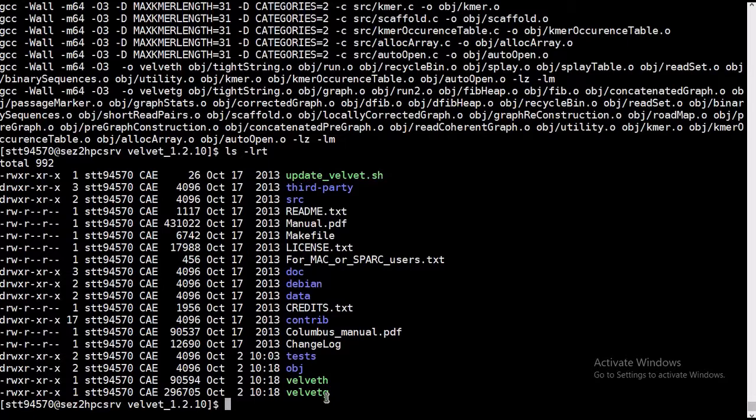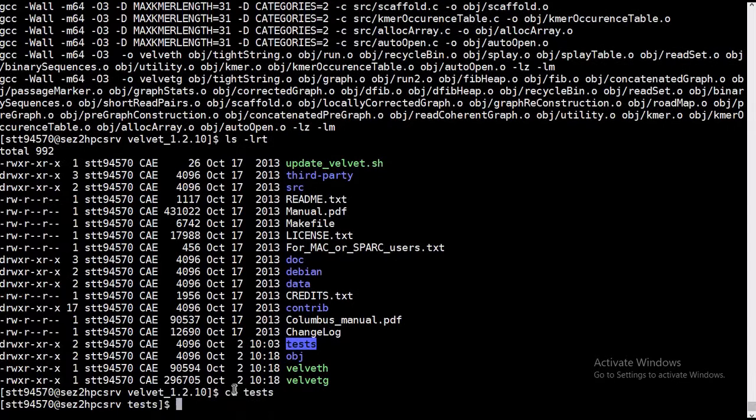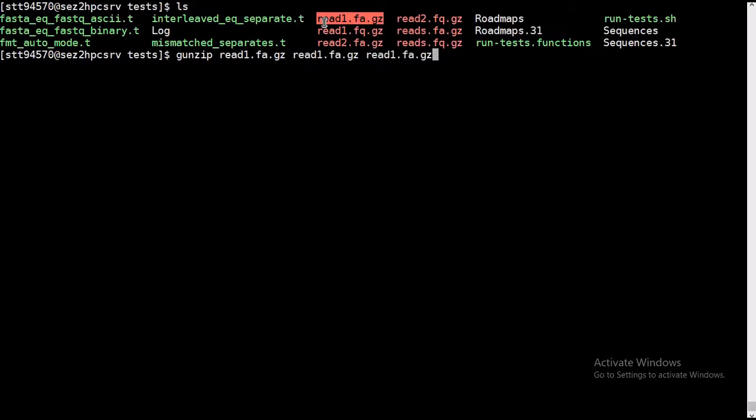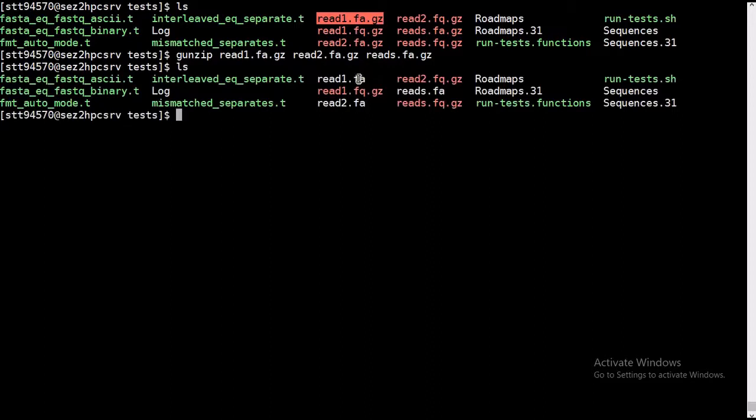And to check, we need to go to the test folder and unzip those test files. So I am directly unzipping. Here we are unzipping it by gunzip, and you can see here these three files, one, two, and three.